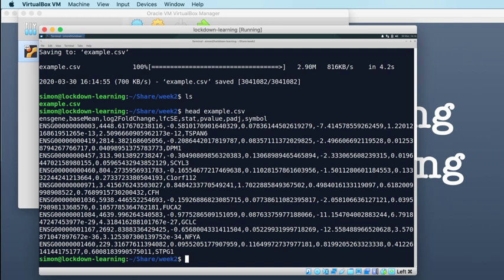And then there are other things as well. I'm going to introduce you to at least 4 different commands today that will allow us to begin to work with this kind of tabular data. So to begin with, it can be quite useful to know... So this is a table. We have 1 row per gene in this case. So it can be quite useful to know how big the data is that we're working with.